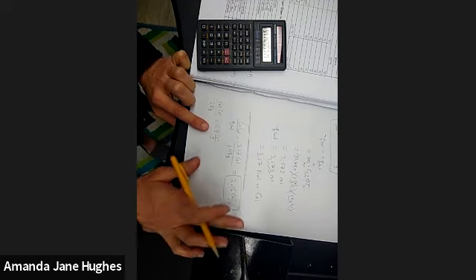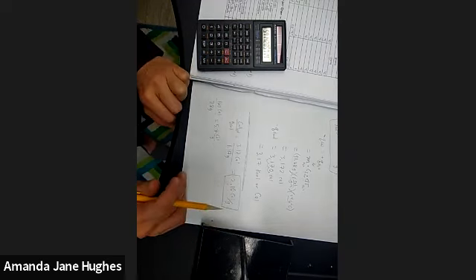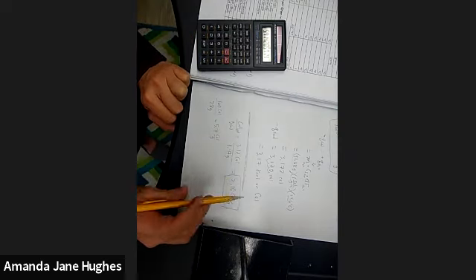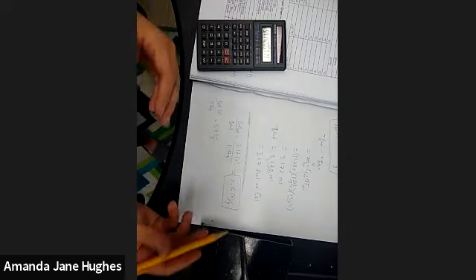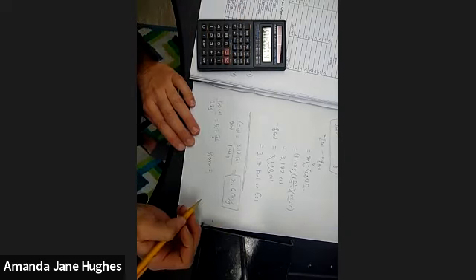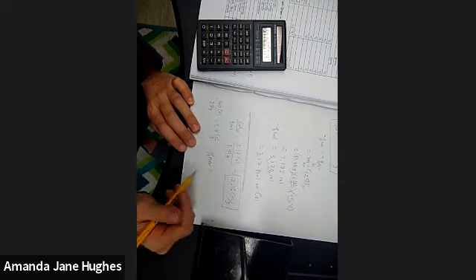There's a lot of reasons for this. Again, your calorimeter that you're using, you're going to lose a lot of the heat to the air. You're going to lose some of the heat to the aluminum can as well, and we didn't account for either of those losses. So this is okay, but let's just go ahead and calculate a percent error to put a numerical value on how off our experimental value was.